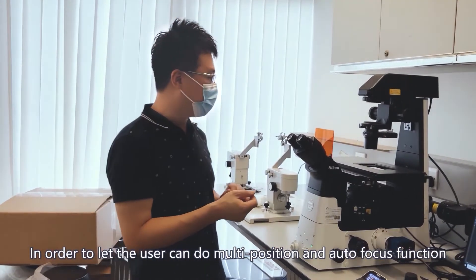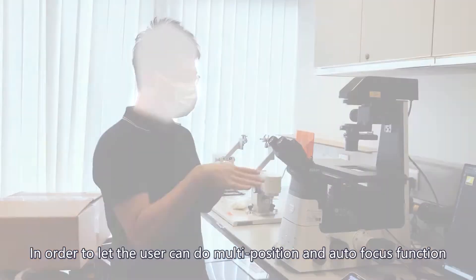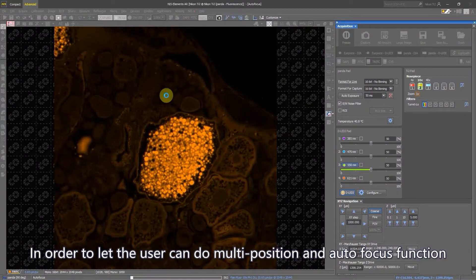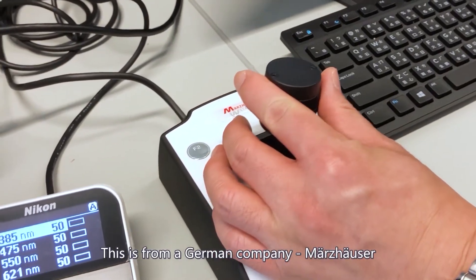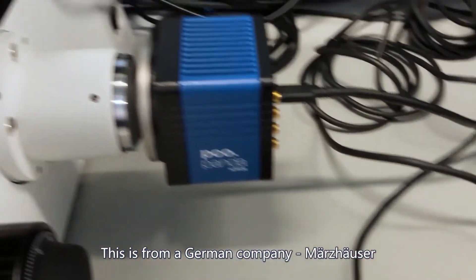So in order to let the user do multi-position and auto-focus function, I put a motorized stage. Even if it is not from Nikon, it is from a German company, Marzhauser. I can enjoy the XY motorization function, so I can do multi-position.